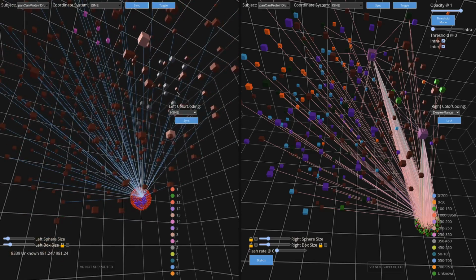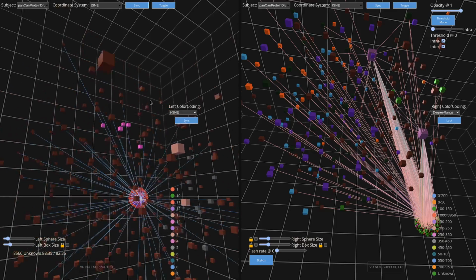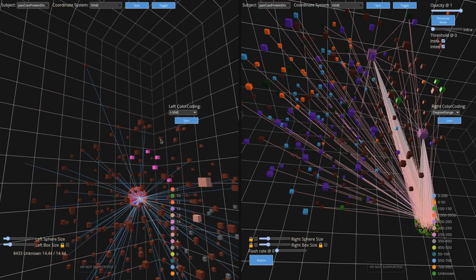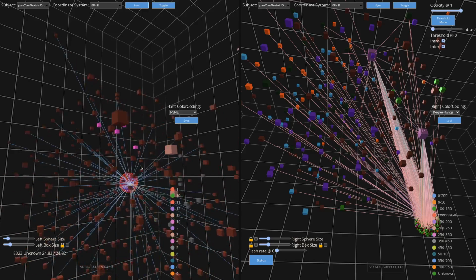so we can see, because we use DBSCAN to cluster and assign module membership to nodes based on their positions in the coordinate system, and try to identify clusters.